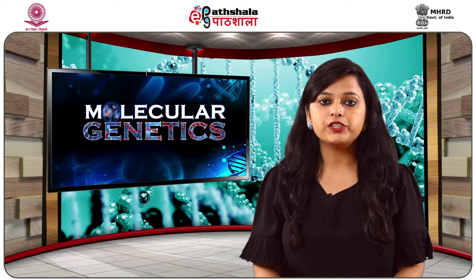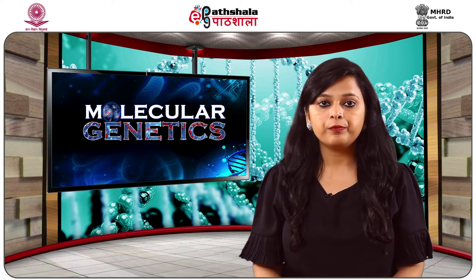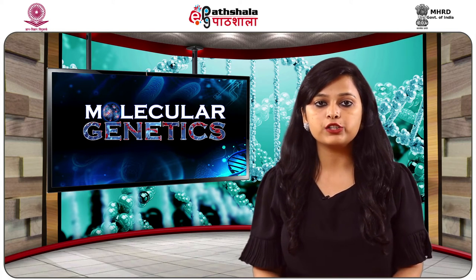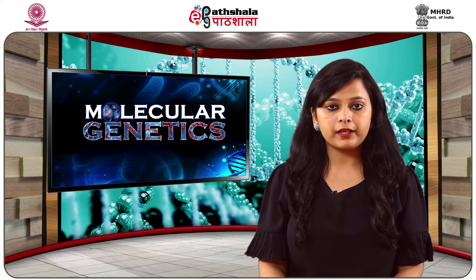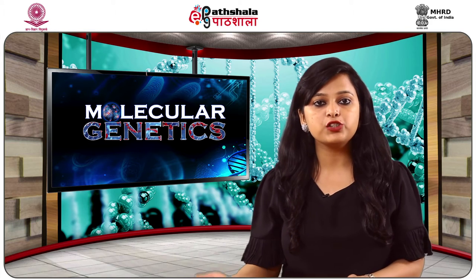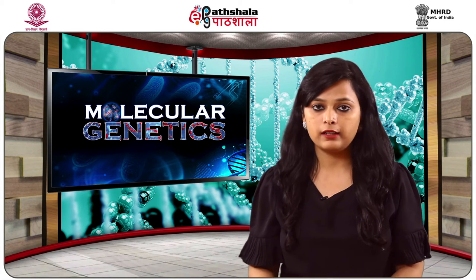Likewise, in the case of a gene library, the DNA from bacterial colonies or bacteriophage plaques can be transferred and immobilized by growing them on solid medium plates, thus enabling the identification of a single colony or plaque of interest among a huge number of colonies. After hybridization between the DNA and the probe, the colonies carrying the gene of interest can then be singled out from the original master plate for further analysis.